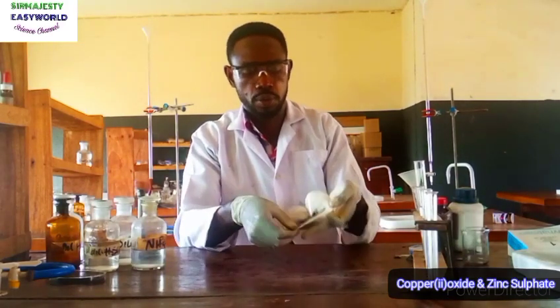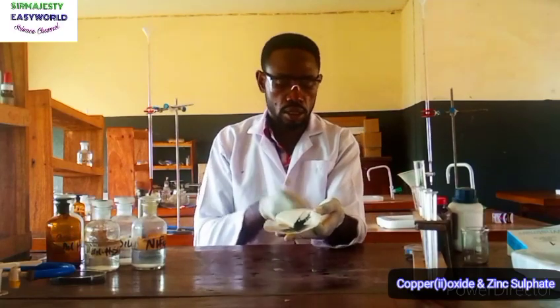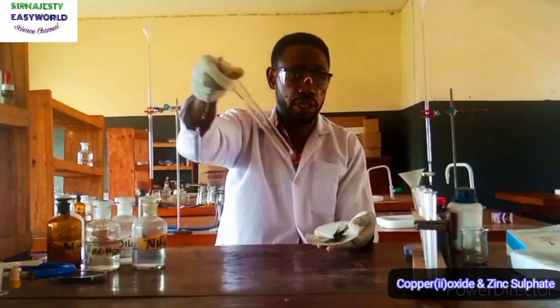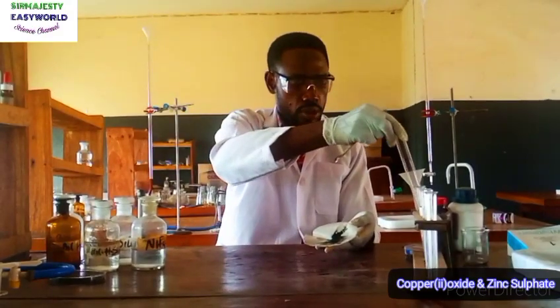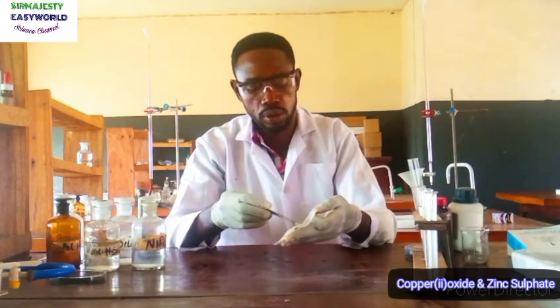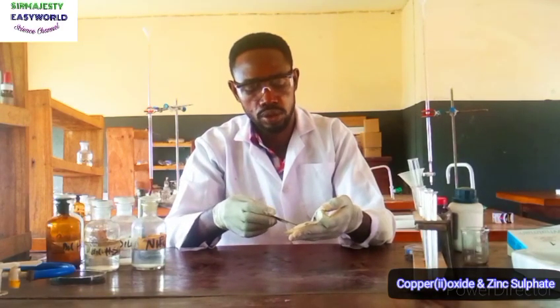Okay, open the filter paper. This is the residue. So here is my spatula. Here is the boiling tube. A boiling tube is just a bigger test tube. So I will scoop, and I'm going to introduce this into the boiling tube.